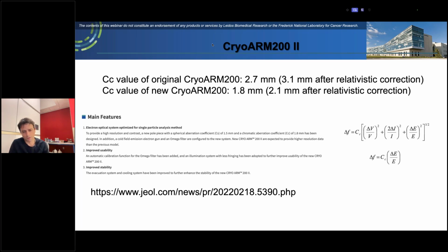If you think that spatial coherence is limiting you as well, that could be a factor too. But definitely with the focal spread, it could be a relevant factor, so all these improvements matter, though there are trade-offs involved as far as tilting and the many funky microscopes going out into the field nowadays. If you think about Holger, he has a situation where, with his C_S corrector, you add on C_C, but then with the monochromator you drop the delta E, so it counterbalances that a bit.